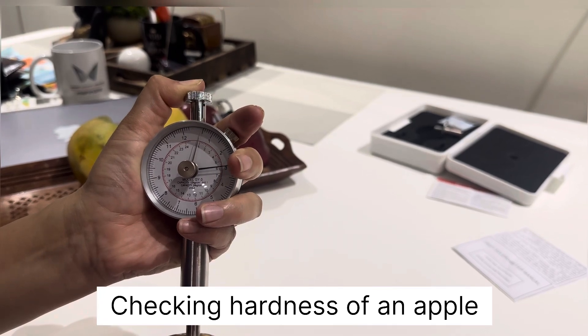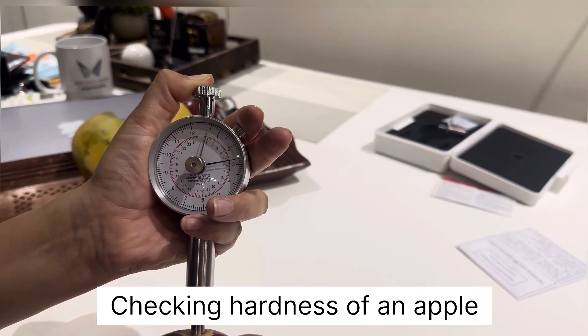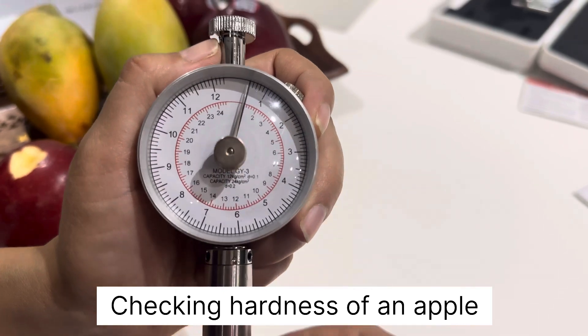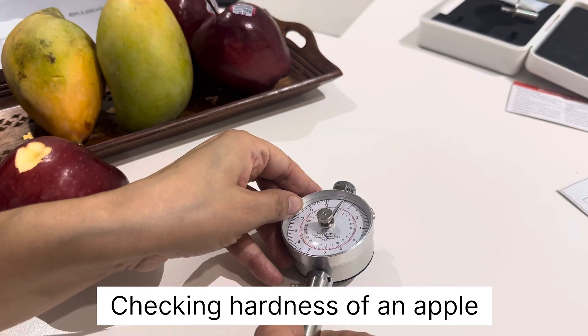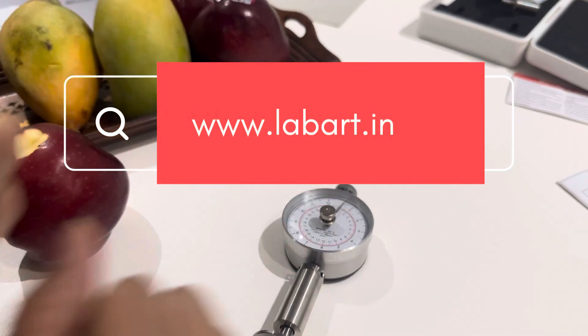The pointer will display the hardness of the apple. Since we used the 8 mm pressure head, the reading is 6 on the inside scale. This is how we check the hardness of an apple. Likewise, we can check the hardness of other fruits as well.